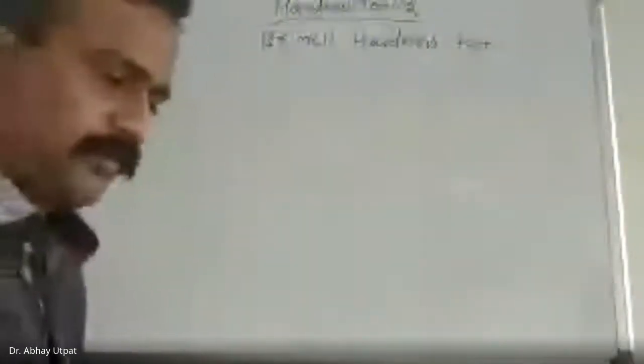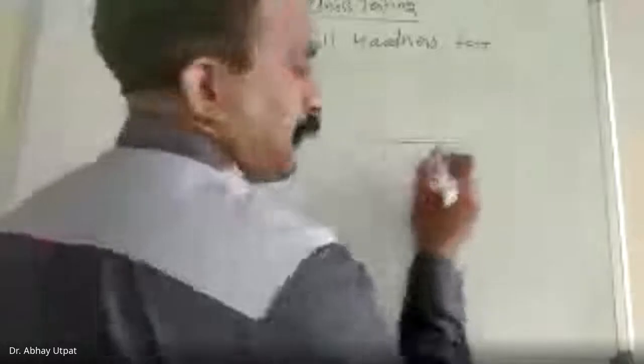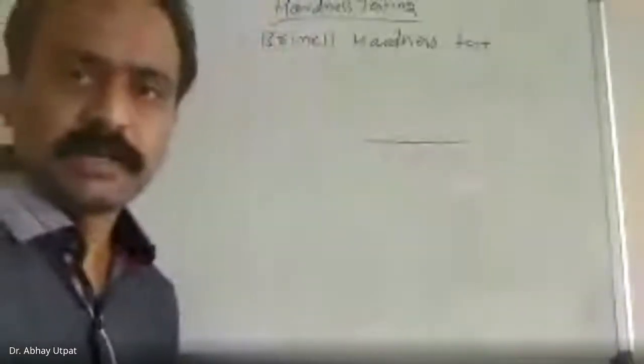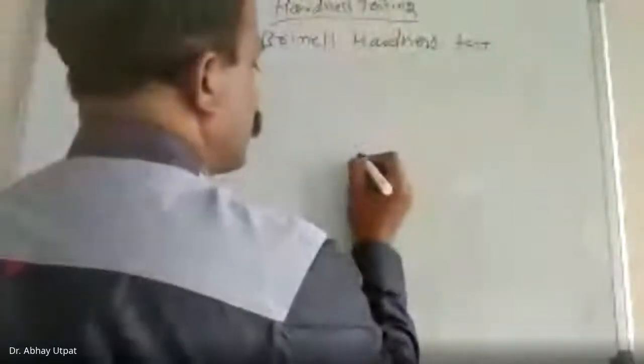Works on the principle of area of impression. Brinell hardness test works on the principle of area of impression. Make a star mark to this statement.